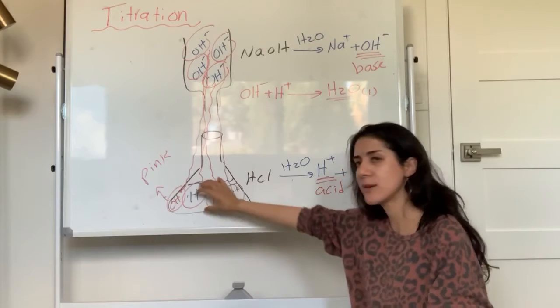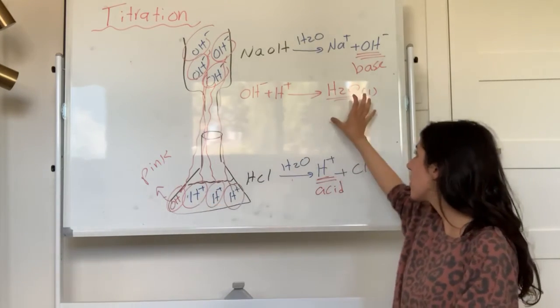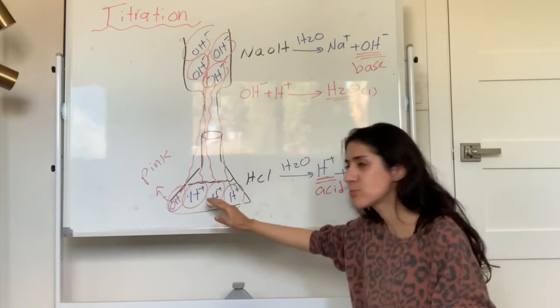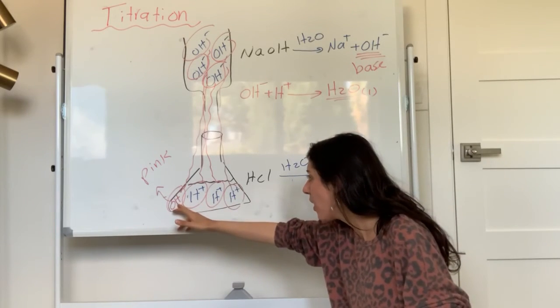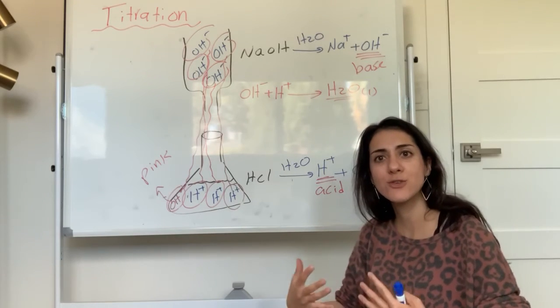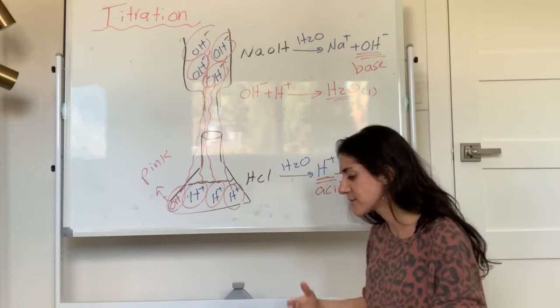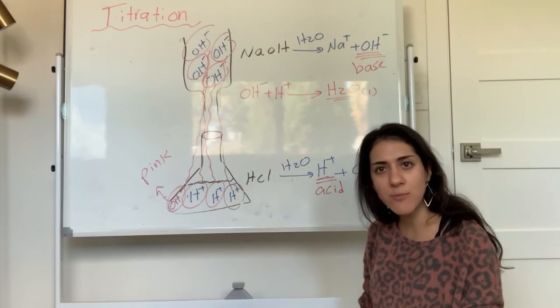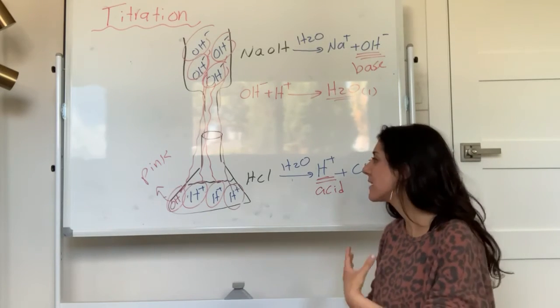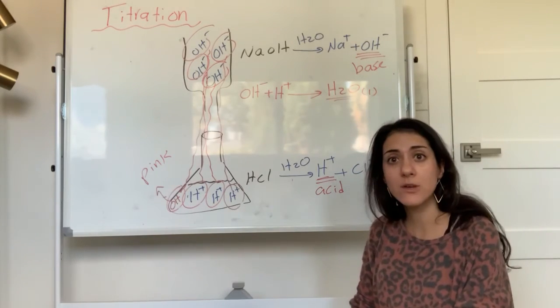So this was acidic, it was a clear solution. I keep adding the base. The base reacts with the H+, forms water, and neutralizes it out. Once you add OH- and there is no more H+ to react with, I only have OH- in the solution. It is going to be basic now and change color, because an indicator changes color when there's a pH change. So the OH- here has no H+ left, and that's the end point. When the color changes, we call it the end point. You're going to see the color change going on. So this is the concept of what's going on.